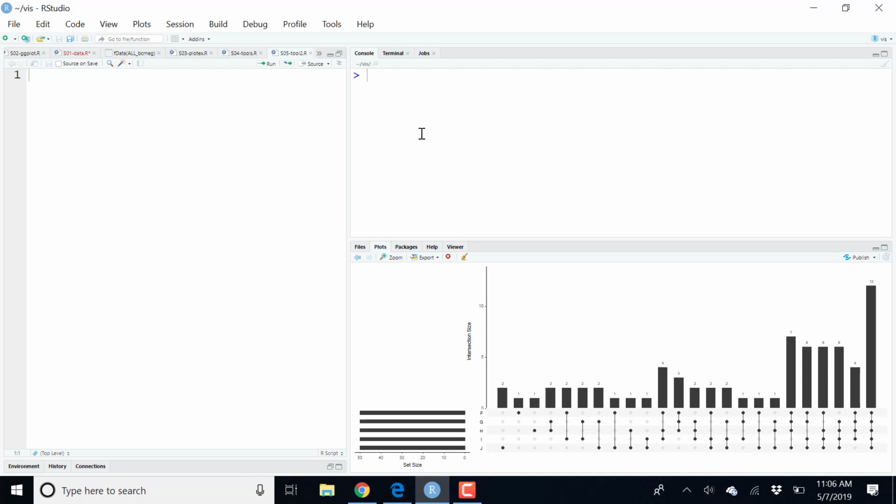And so in this case, 3 and 5 are close to each other, so we would then group 3 and 5 and make it a new group and update our pairwise distances, this time to calculate the distance between 1, 2, and 4, and then the center of this new group 3 and 5.